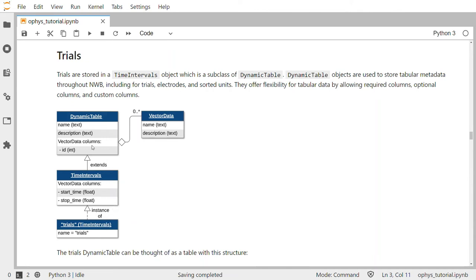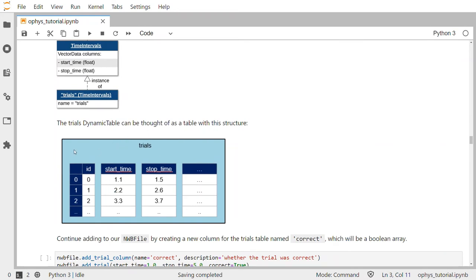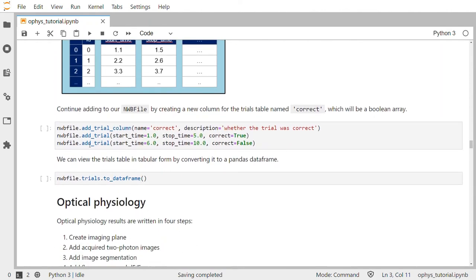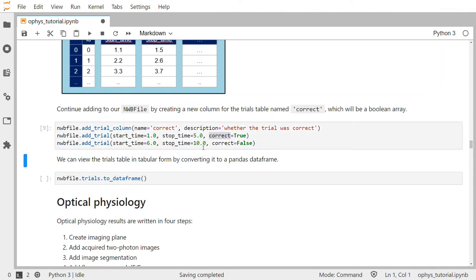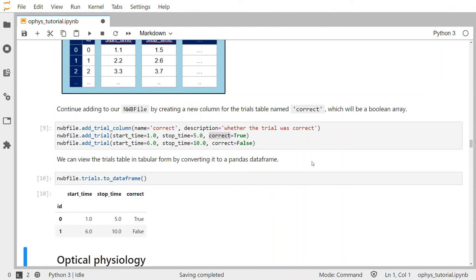The dynamic table has a name and description, and columns of class vector data, each with their own name and description. The time intervals class extends dynamic table and specifies a start time column and a stop time column. Trials is an instance of time intervals with the specific name 'trials', where each row represents a different trial. Let's add a new column named 'correct', a boolean array, by calling add_trial_column on the nwbfile object with a name and description. Then we call add_trial to add a trial, specifying start time, stop time, and the correct column. We can view the trials table in tabular form by converting it to a pandas DataFrame.